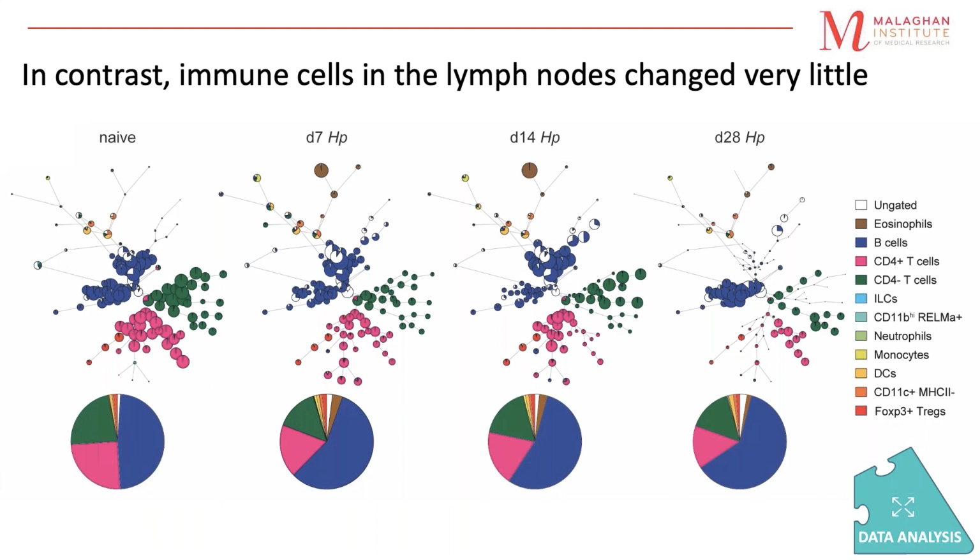Interestingly, when comparing the same time points in mesenteric lymph nodes, we couldn't find as many differences as in gut. We found this quite relevant because routinely mesenteric lymph nodes have been used as a mirror of the intestine, while here we demonstrate the importance of being able to digest and analyze infected gut as single cells to obtain unique and more specific information about the infected guts.